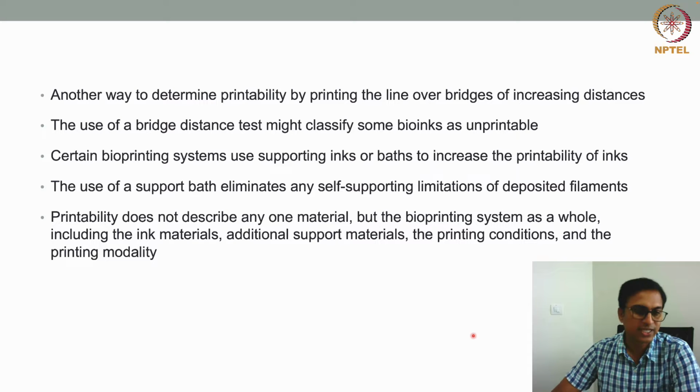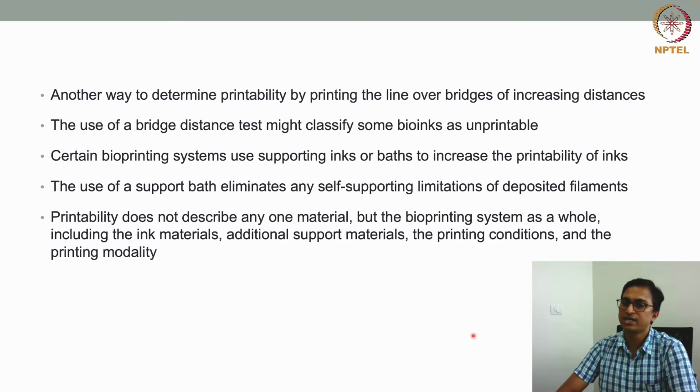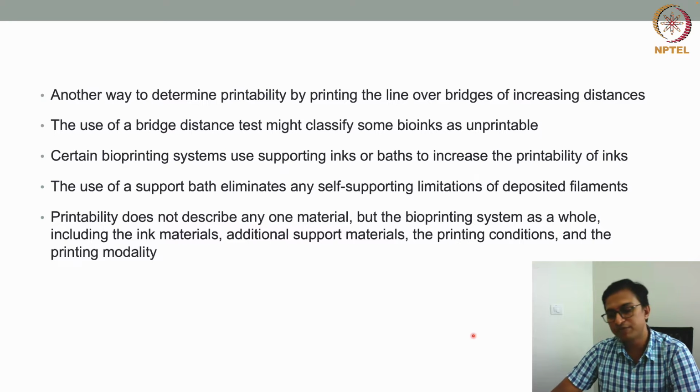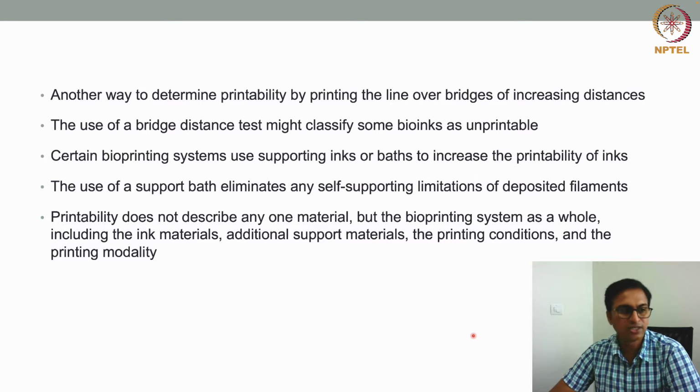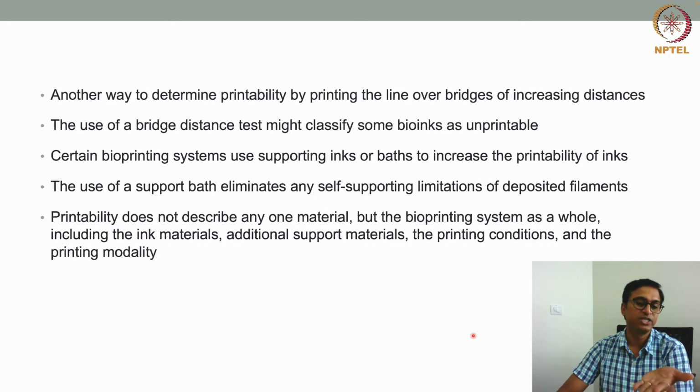All these things together can describe a material as printable or non-printable. We have clearly seen in the earlier example that a bioink can be very well printable in a support bath, but unprintable in conventional bioprinting, where we are trying to print on a petri plate or a glass slide.